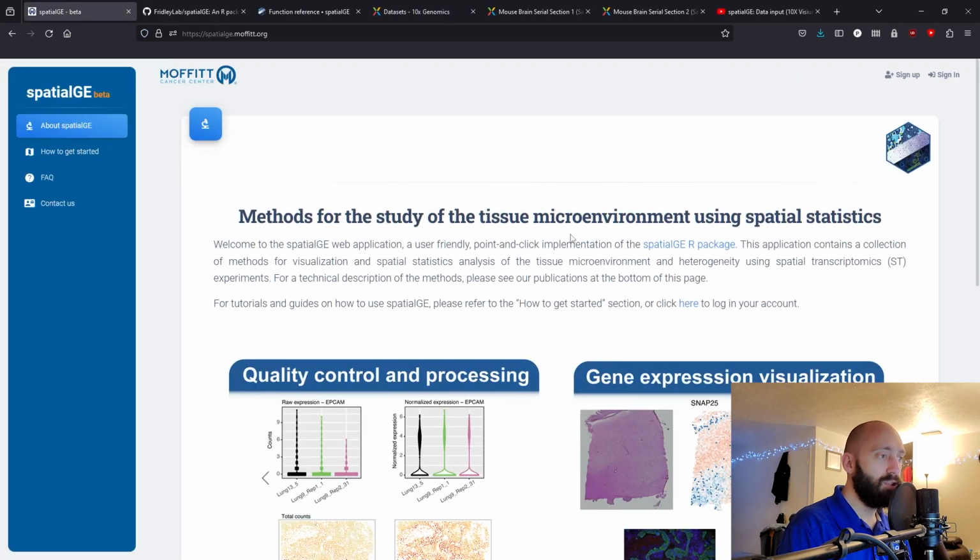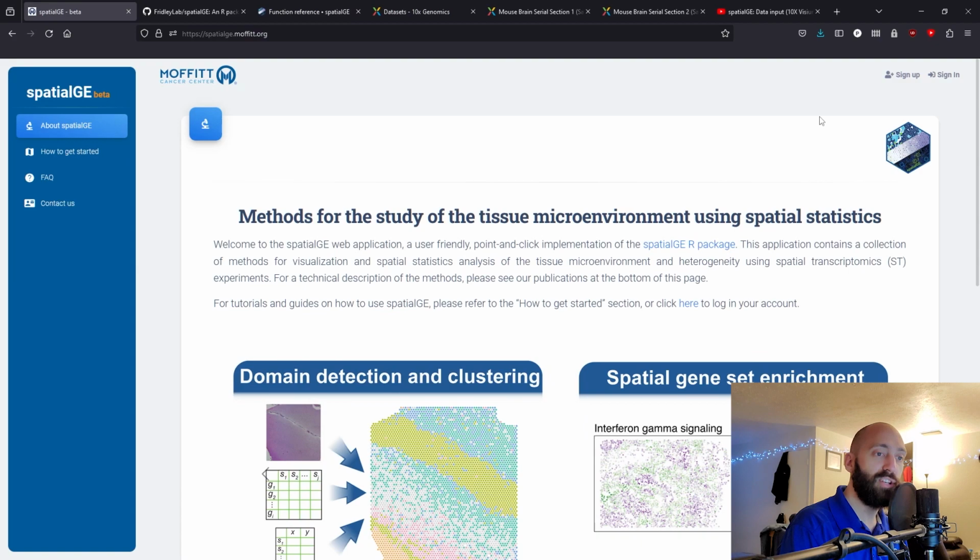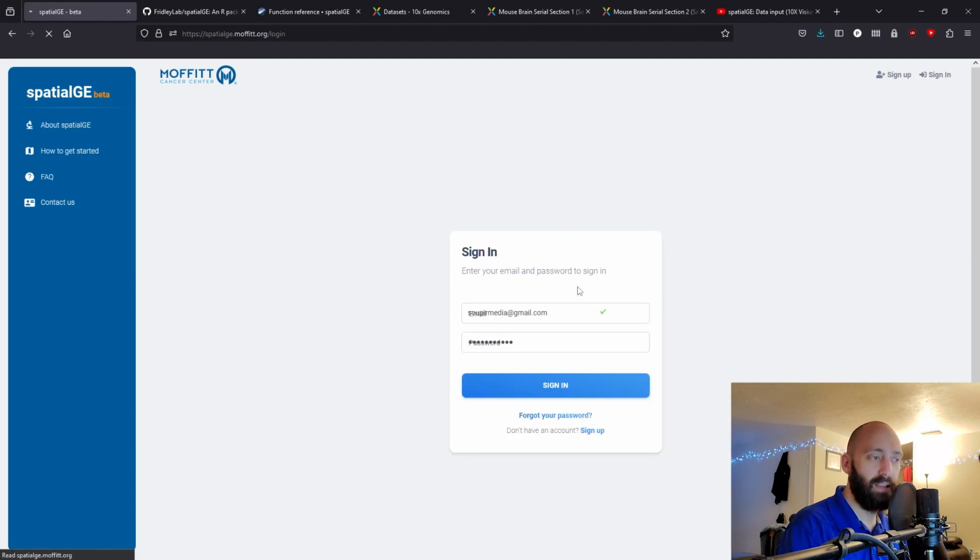If we head back on over to spatialge.moffitt.org, that's the web interface for the spatialGE package. We can sign in.